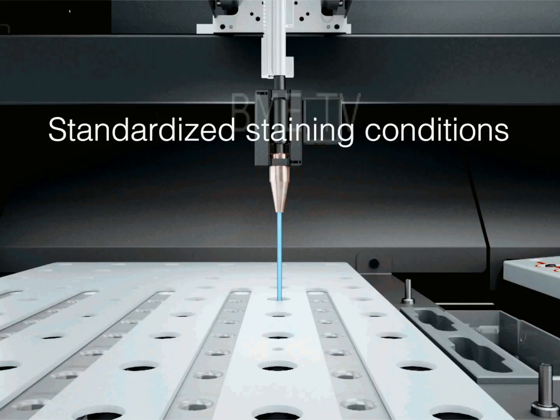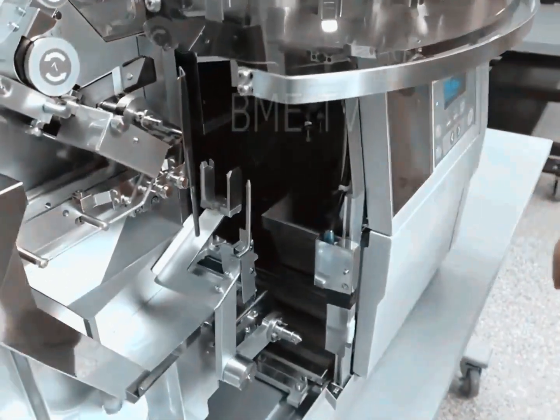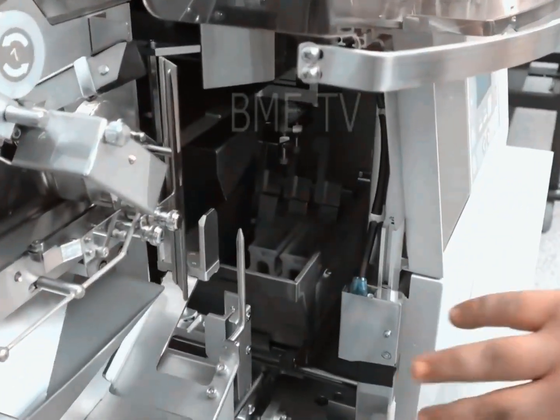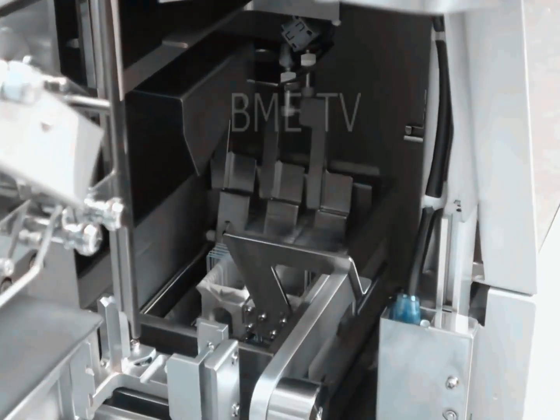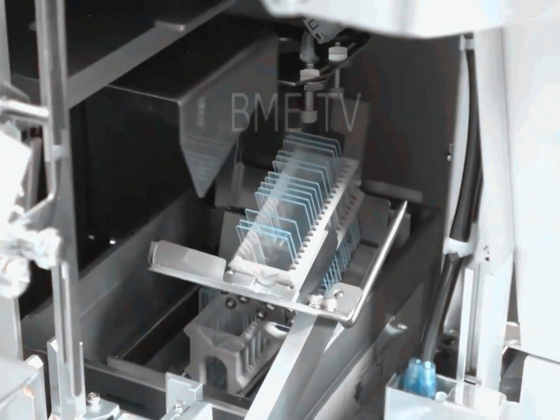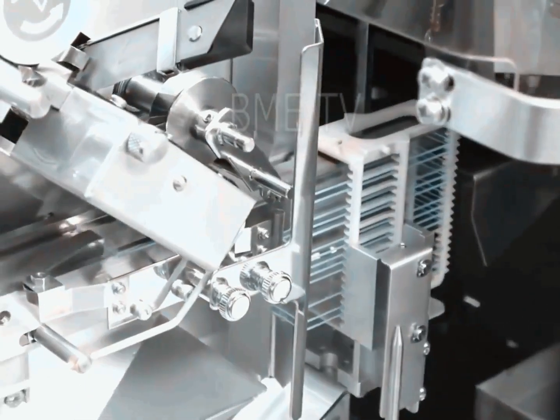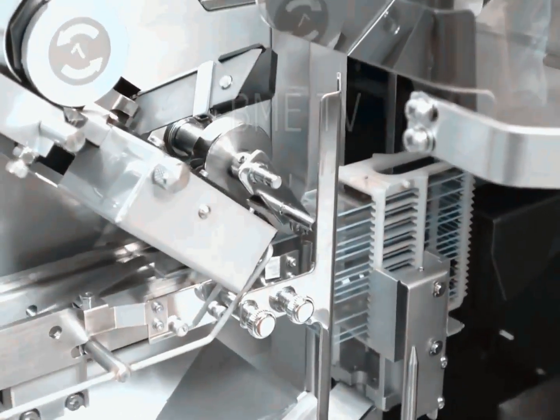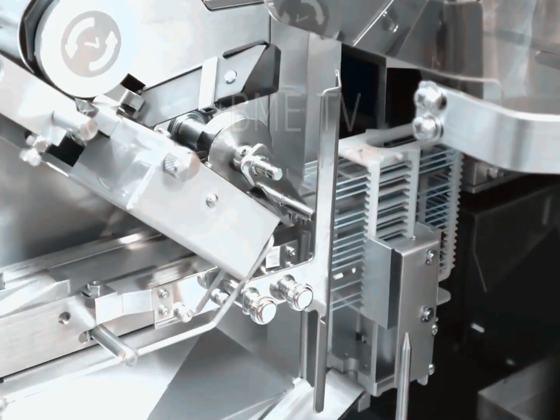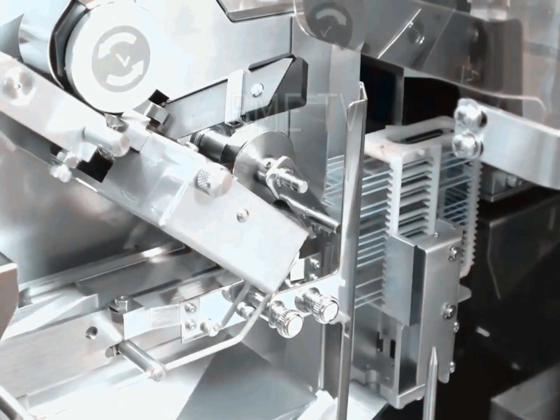Automated platforms vary in their flexibility for variables permitted at each of the staining protocol steps. This has resulted in automated systems being designed and described as open or closed, depending on how similar the flexibility is to manual staining and the diverse reagent choices and timing of staining steps. For this reason, open automated systems are the easiest to migrate to from manual protocols with the least need for alterations. Open automated systems are often preferred in research settings, where the main concern may be developing new staining protocols for the growing number of target biomarkers, requiring flexibility and protocol options.